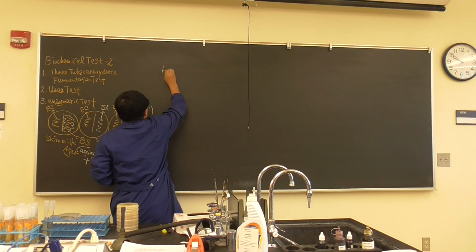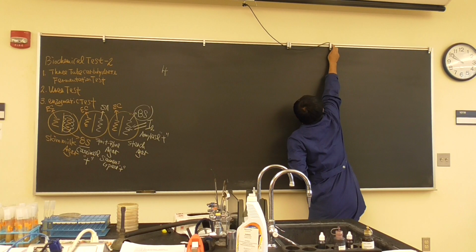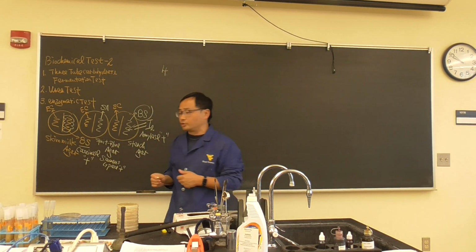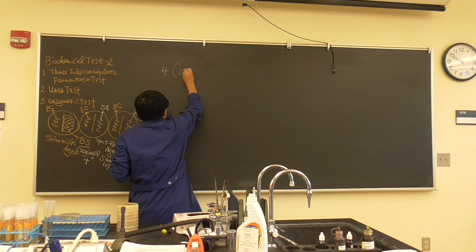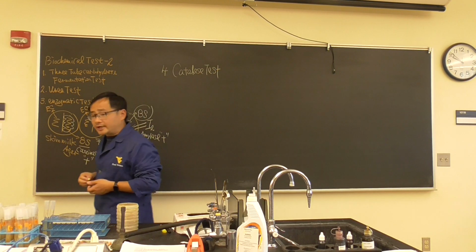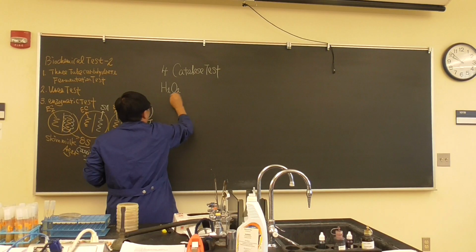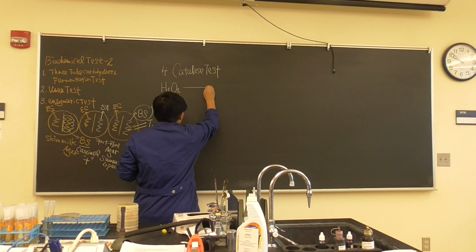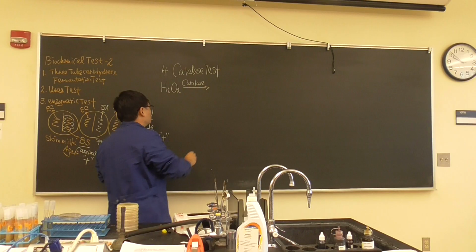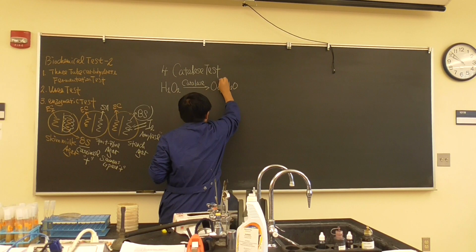So we want to do 3 more testing today. We will talk about several biochemistry tests, then we're going to do more. First one, catalase test. And you already heard about it in the lecture, catalase test. What is that? H2O2, hydrogen peroxide. If bacteria has catalase, it will break down H2O2, become oxygen and what? Water. And this oxygen is bubbling.